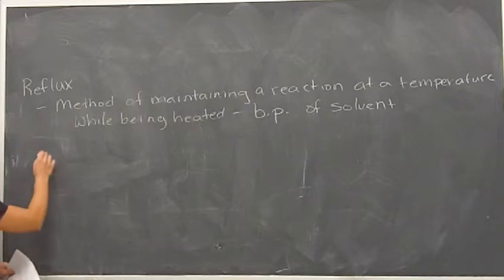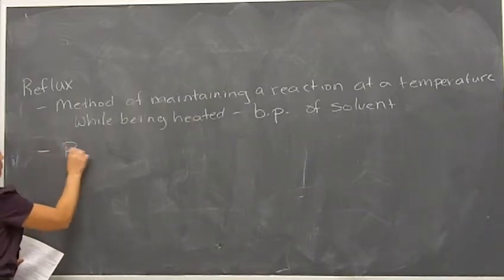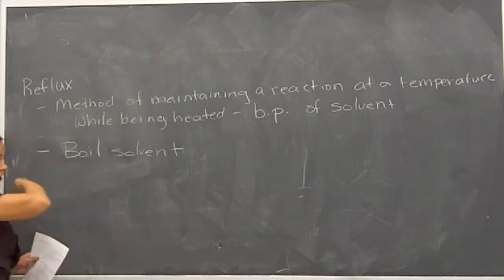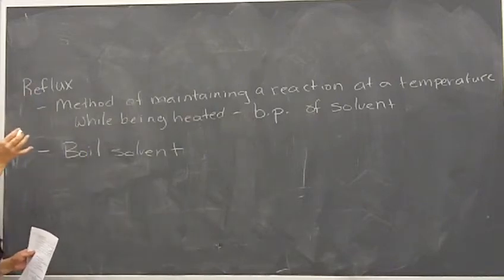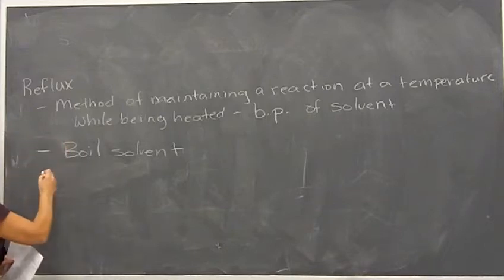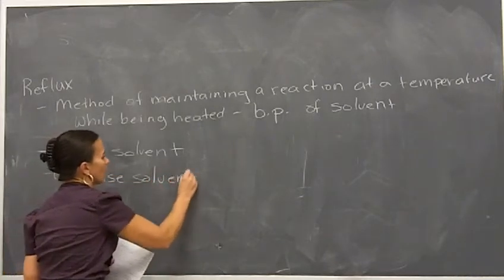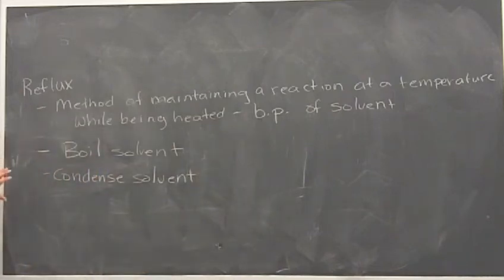So 2 things are key to this, okay? You've got to boil the solvent, okay? But if you boil away the solvent, you will eventually lose the solvent and you won't have anything there to keep the reaction at a constant temperature. So you also have to condense the solvent, okay? So when you're using reflux to heat a reaction, the solvent is boiling, but it is also condensing. So the boiling and condensing of the solvent will keep that reaction at a constant temperature. And that's what's involved with reflux, okay? But it's really important not only that it's boiling, but it's also condensing.